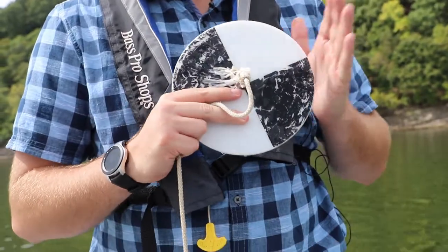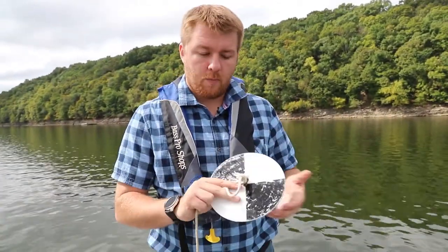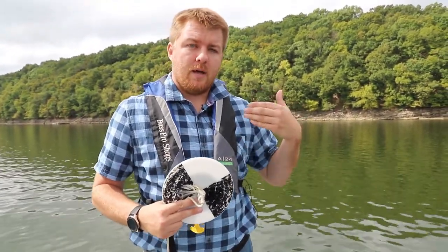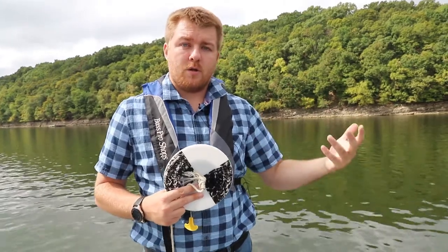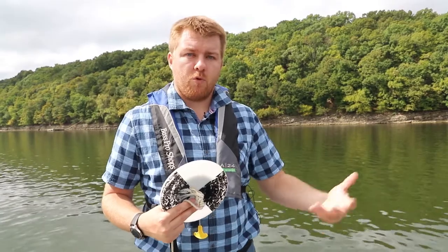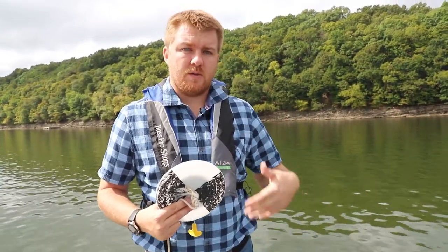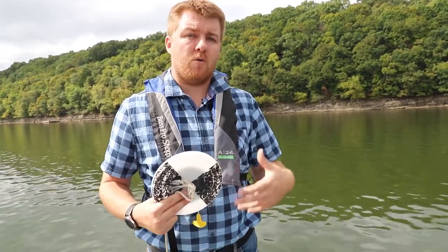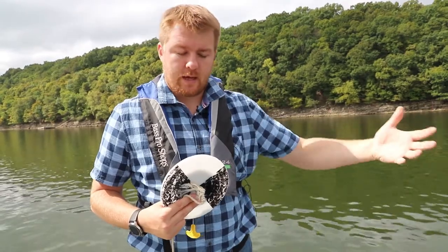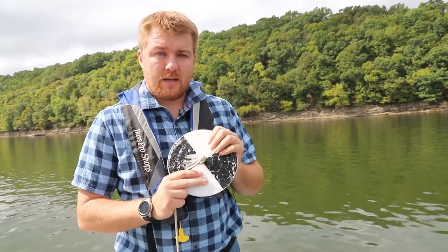The nice thing about the Secchi disk is that it's something everyone can use and something you can easily make your own version of at home. At GRDA we have a new program called Guard the Grand, where we're trying to get people that live around the lake or within the watershed to help us improve Grand Lake's water quality by implementing best management practices on their property or even just behaviorally changing the way they do certain things. One way to track water quality is by using the Secchi disk.